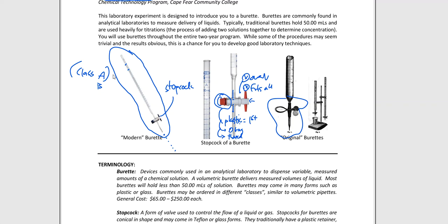So if I wanted to do some titrations, that was great, because I would go over to that clamp and take my finger and thumb and give that clamp a light squeeze. If I did it in a controlled way, then guess what? I would get my drip, drip, drip, drip out of the bottom, and I'm ready to go. I'm ready to titrate. Give me 100 samples. I'll sit here and squeeze the clamp all day if that's what you want me to do. Well, okay, that's kind of what was going on back in the day.